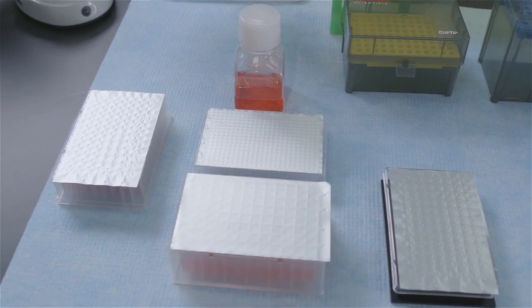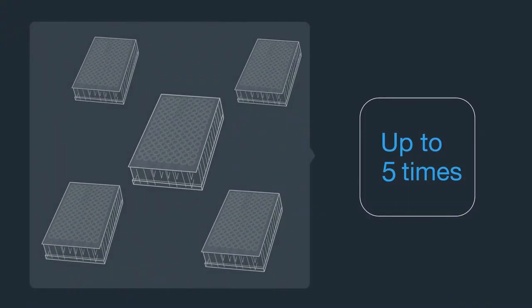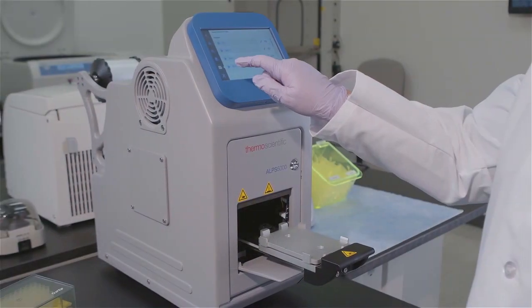This helps limit melting around the well, allowing each plate to be sealed up to five times. Switch easily between the two modes on the settings screen.